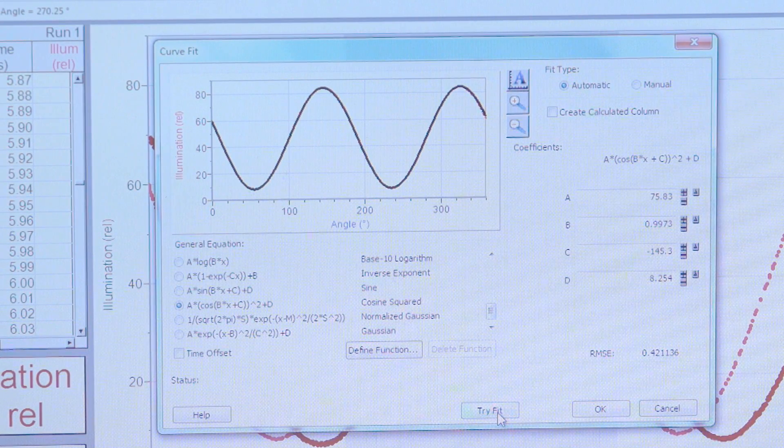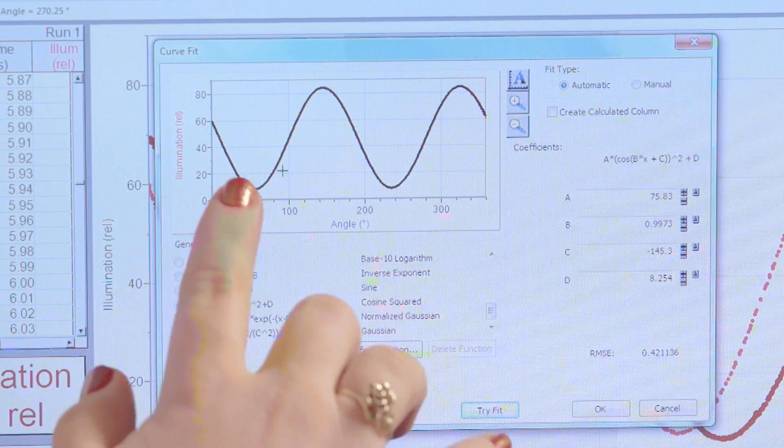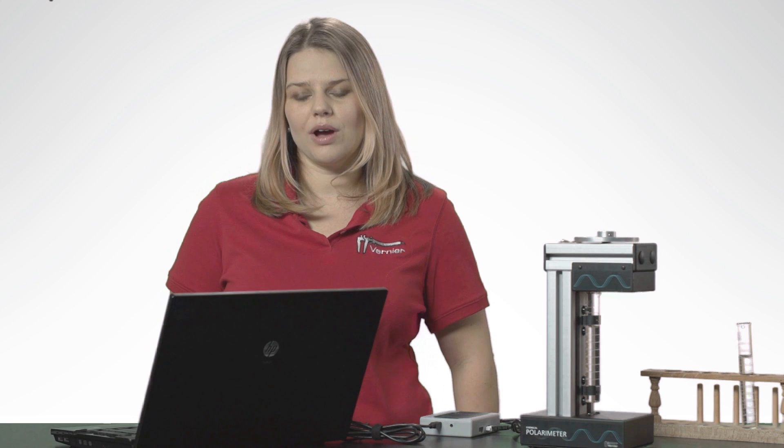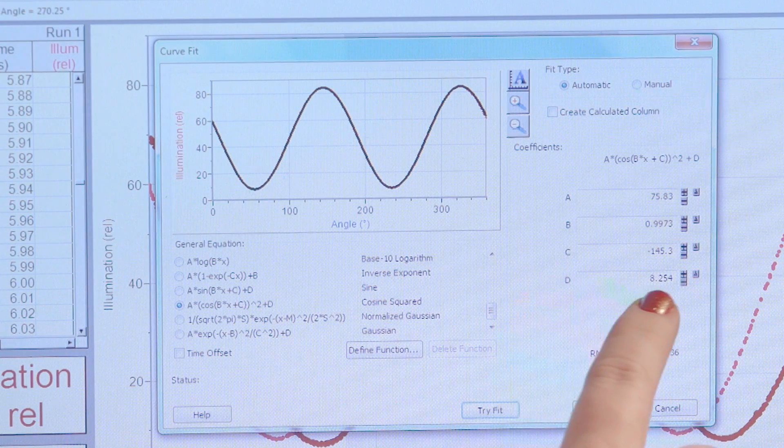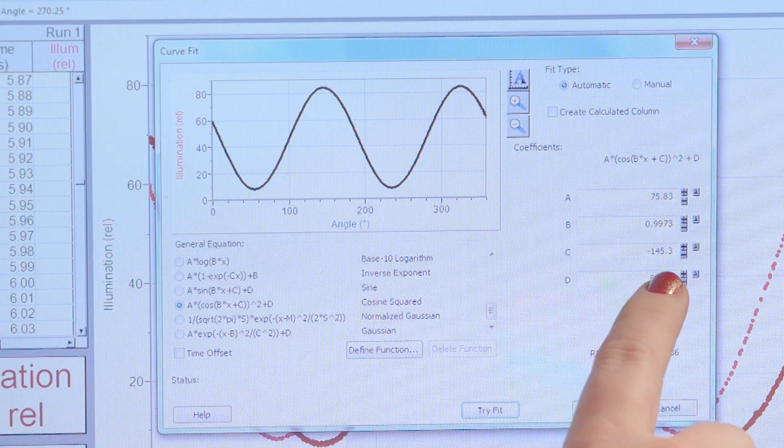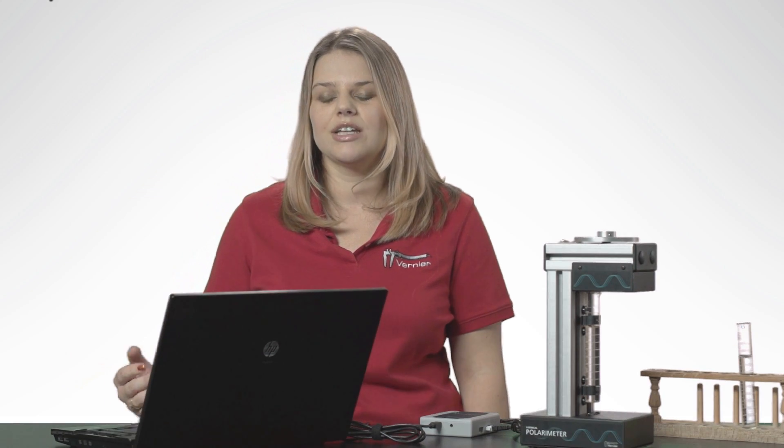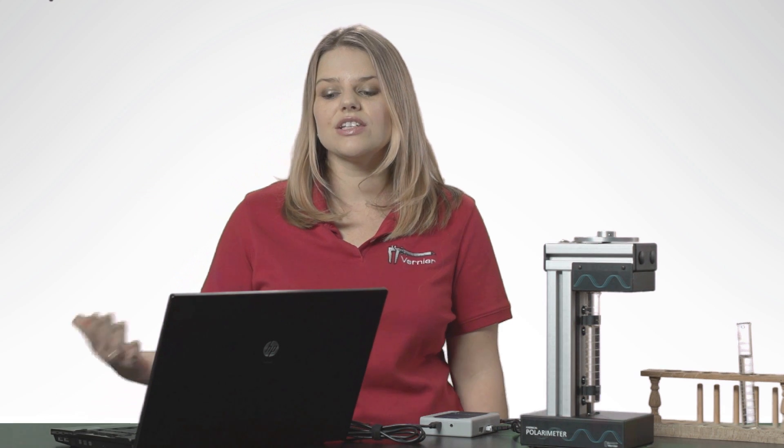You see the curve fitting black line lies perfectly on the graph screen. The coefficient that we care about with the cosine squared fit is the opposite sign of the c value. The c value here reads negative 145.3. Therefore, the angle at maximum illumination is positive 145.3. This is for the blank.